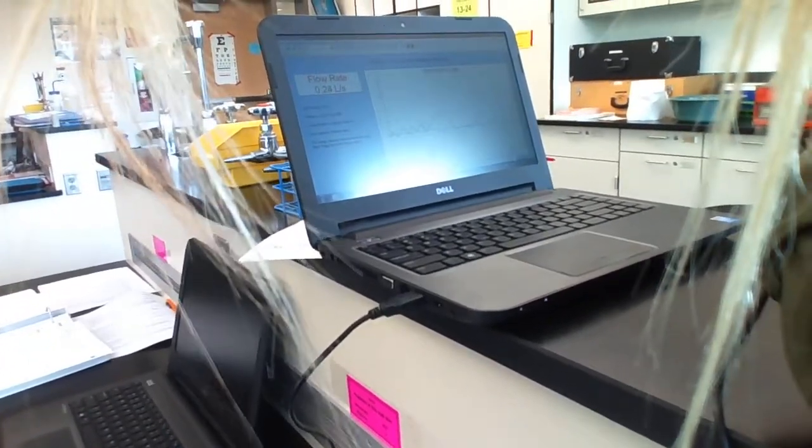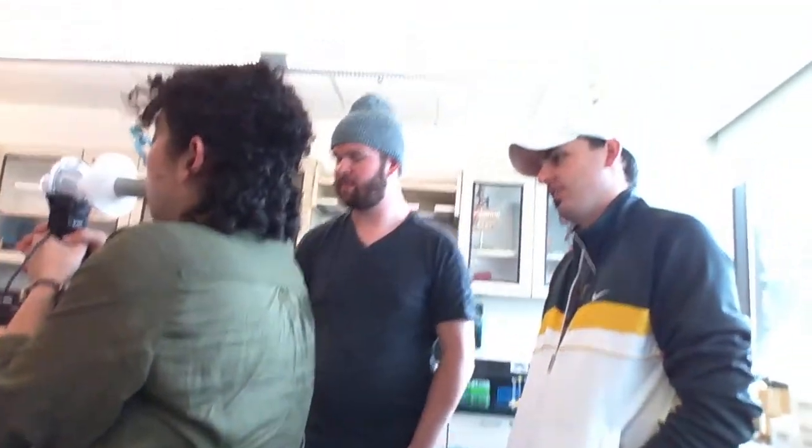Meanwhile, our test tubes are still being held at body temperature, and the other two are at 0 degrees Celsius. That was the big breath in. Recovery breaths. So Allie's just breathing.